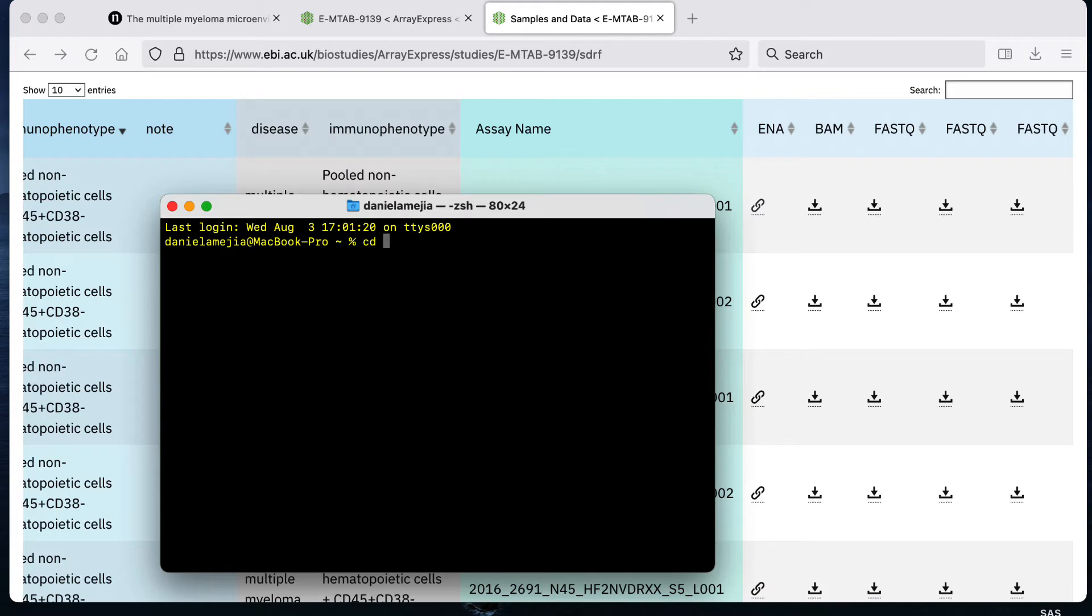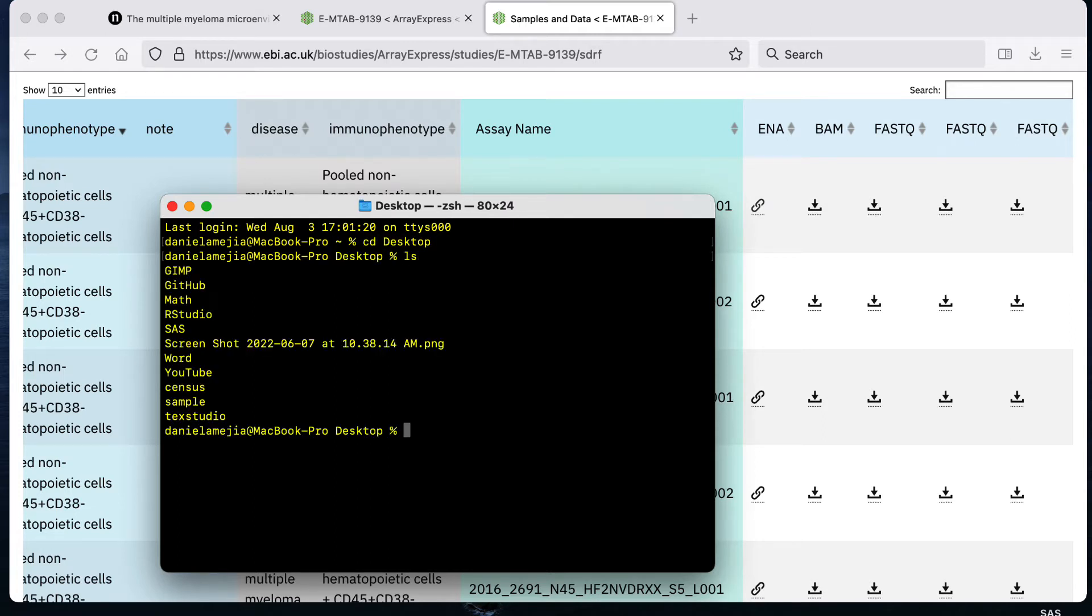Basically what you want to do is you want to create a folder that's going to have all the FASTQ files per one subject. For me I have already created this folder on my desktop folder. I'm going to cd desktop and I created a folder called sample that's going to be used in this video.